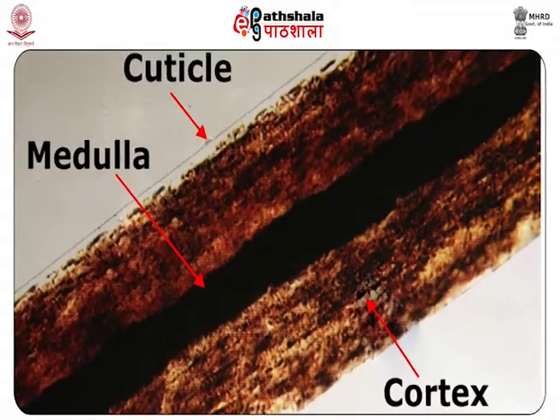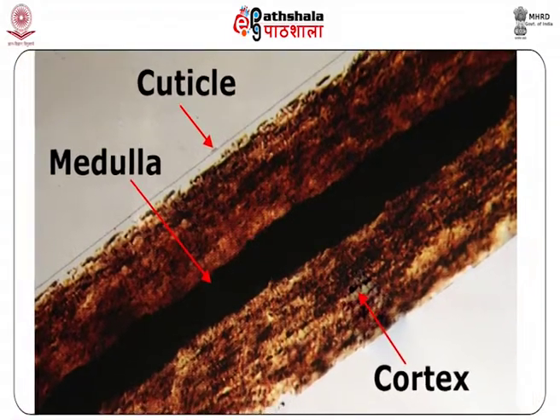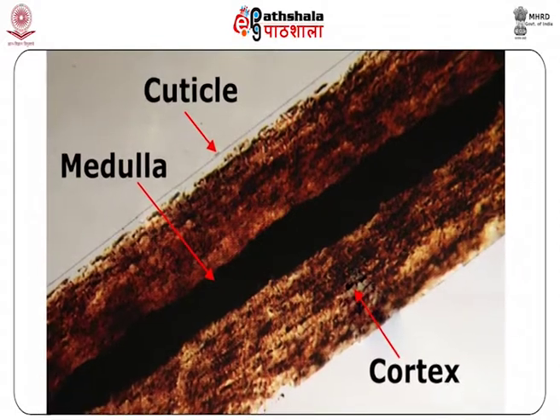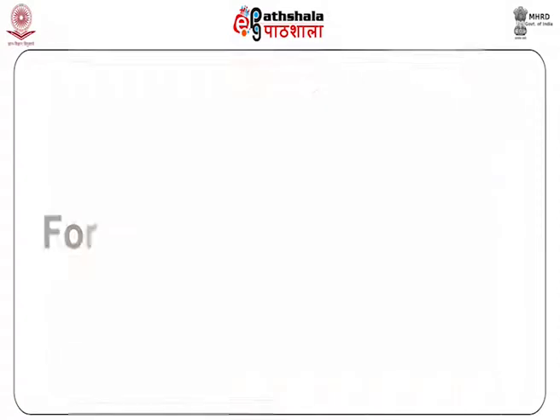Evaluation of the minute features of the questioned hair to known hair samples aids in determining whether a transfer may have occurred. Forensic comparison of hair.